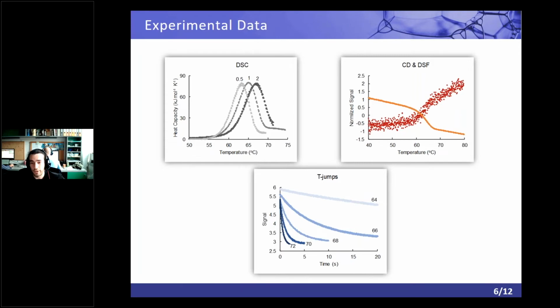And this is important, because when we stabilize the protein, we introduce a mutation, then we measure melting temperature, and we say, okay, we now have a protein that is 3 degrees more stable. But actually, which temperature to choose? Also on the right-hand side, it's really strange: how do you select this middle point of transition? What if there are actually 2 transitions, and you don't observe them in the data?